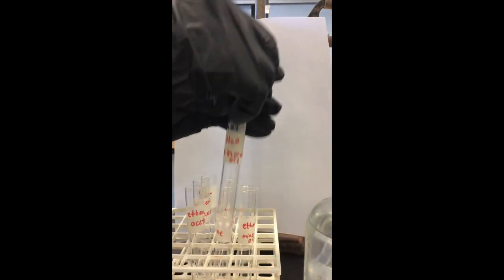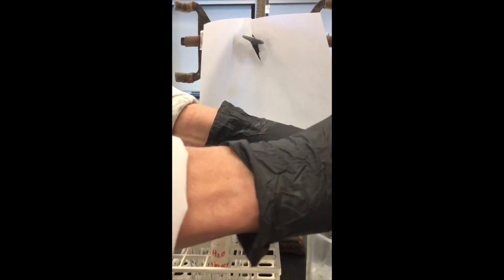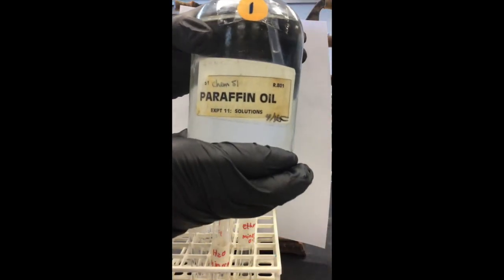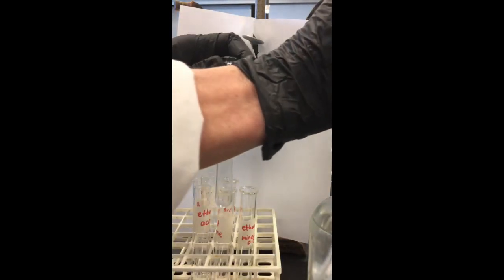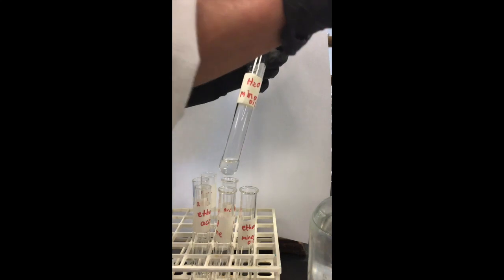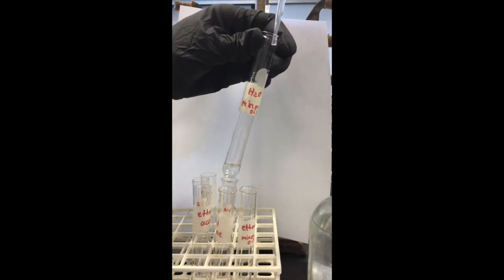And again, I have the water in these first 4 test tubes already. So mineral oil is also known as paraffin oil. So let's see if water and oil mix.